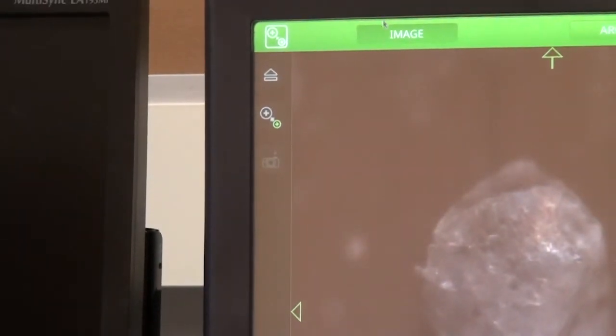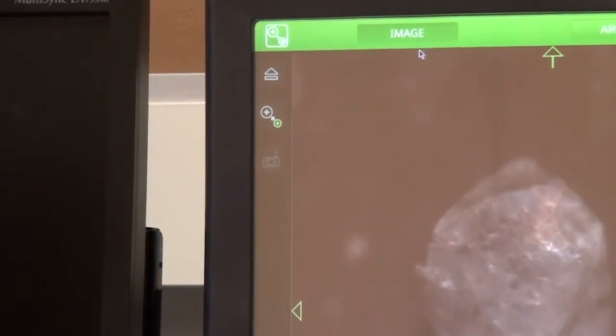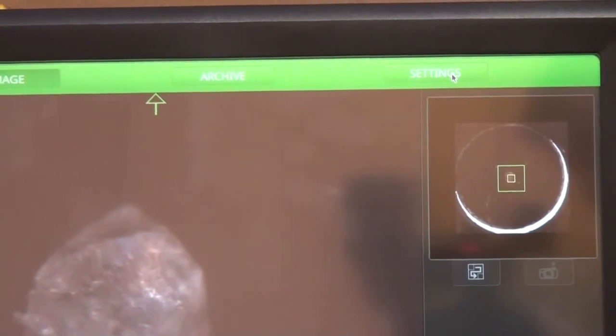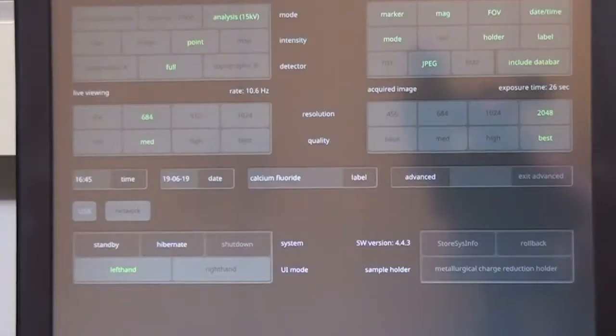There are settings on the top, and we are going to click on settings to get the options for SEM mode.